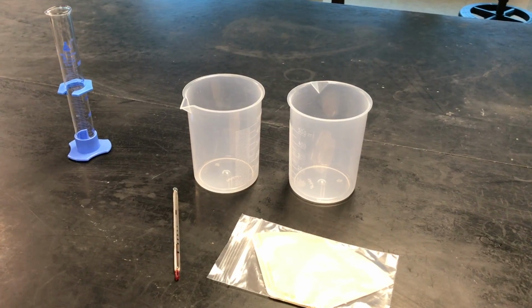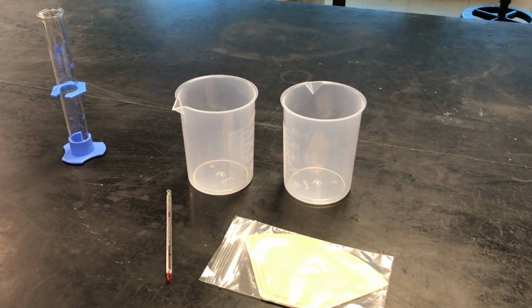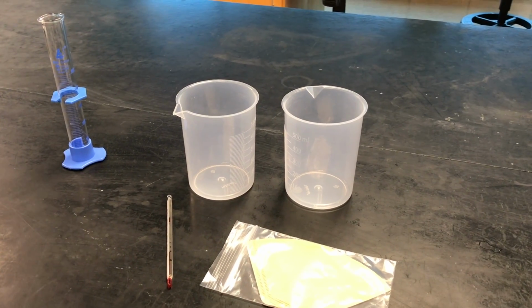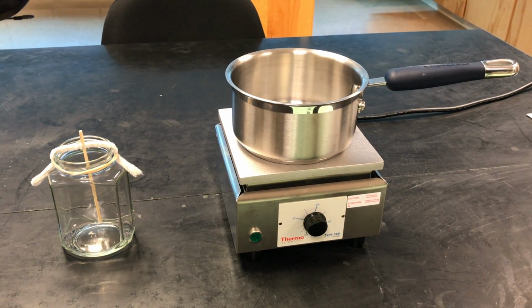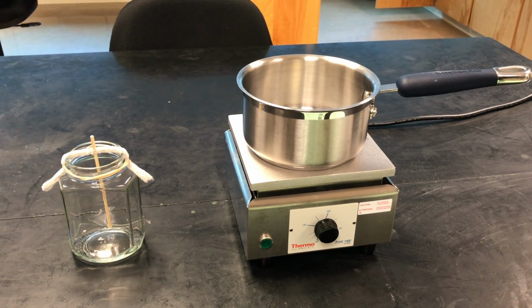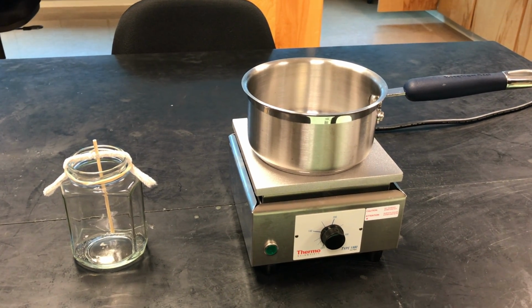For this lab, you're going to need a few things from your lab kit: a 50 ml graduated cylinder, those 2 beakers, a coffee filter, a thermometer, the digital scale, and a glass stirring rod. On your own, you're going to need to supply some water, and it can just be tap water, your solute of choice, which you'll see in a minute, a string or pipe cleaner.